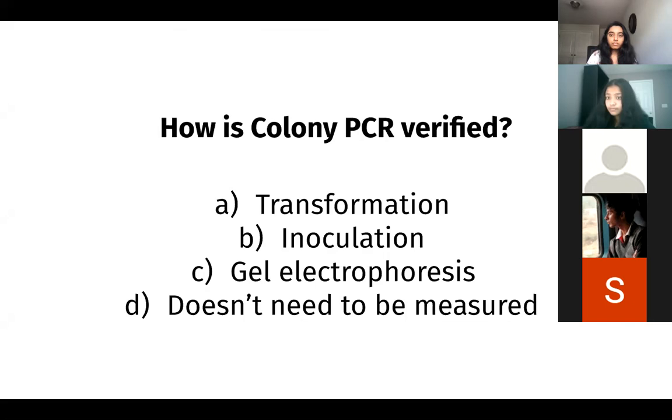I actually have a question. I didn't understand the difference between colony PCR and just normal PCR. In general PCR, what is the role of the cells being there, like colonies of cells?